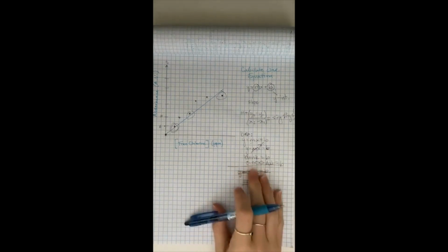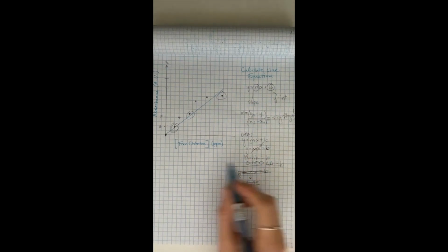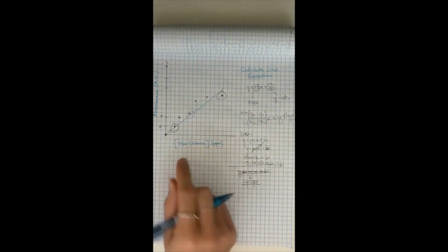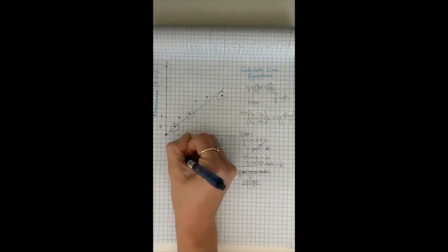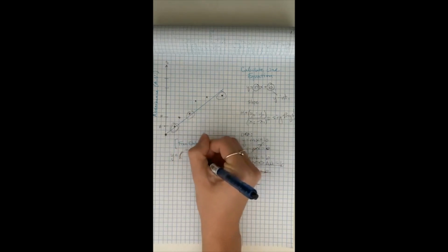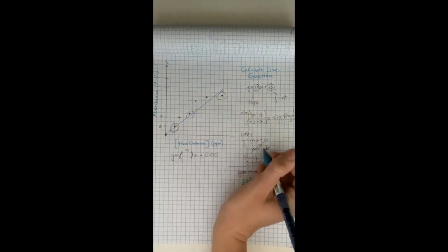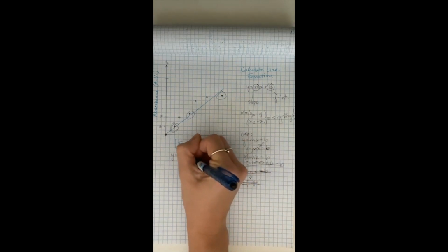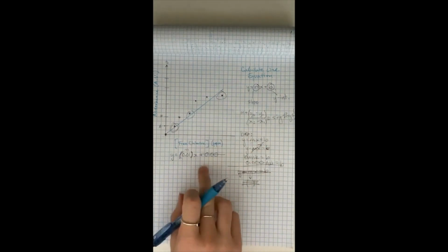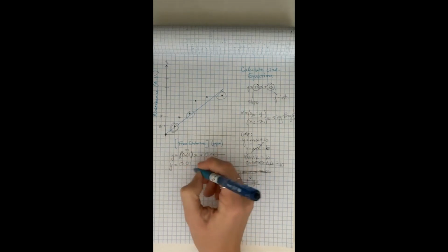Went on a tangent with that, so we're just going to go back. Now we have our line equation. So you're going to write this out and report it in your discussion. So you're going to state that y equals whatever value m was, x. Technically it's plus that 0.0. For this case, we'll just say this is like 0.01. But since it's equal to 0, it's kind of useless. So we can say our line equation is 0.01 x.